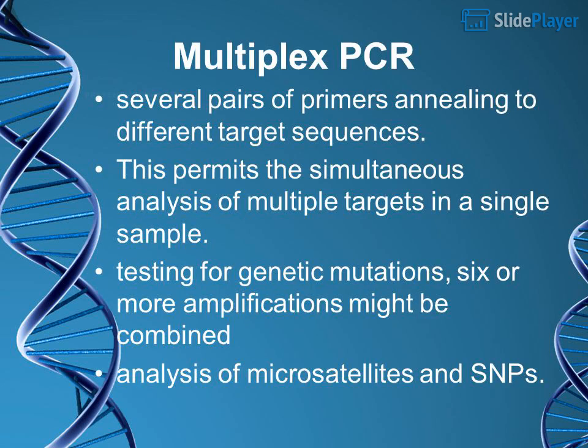Multiplex PCR. Several pairs of primers annealing to different target sequences. This permits the simultaneous analysis of multiple targets in a single sample. Testing for genetic mutations, 6 or more amplifications might be combined. Analysis of microsatellites and SNPs.